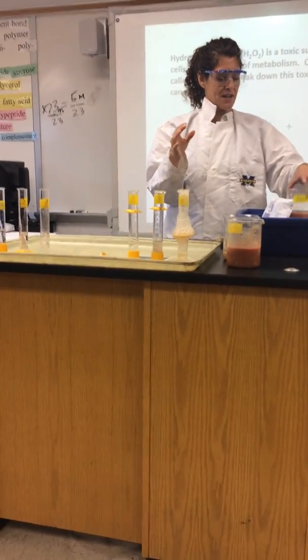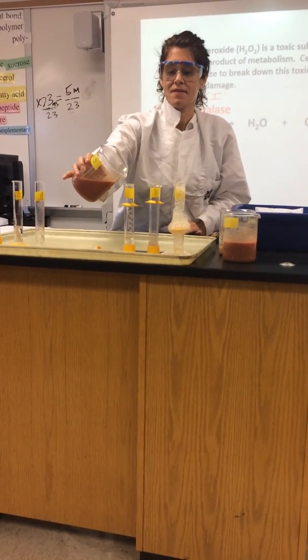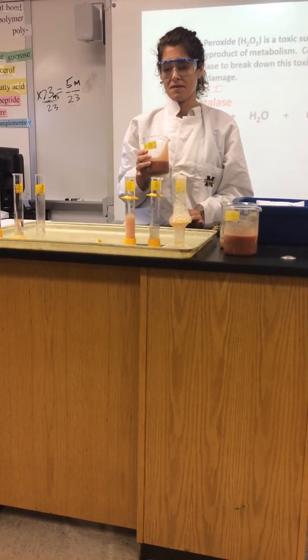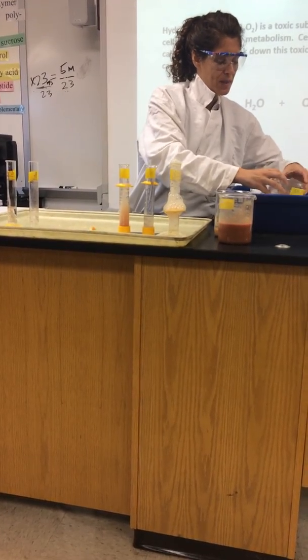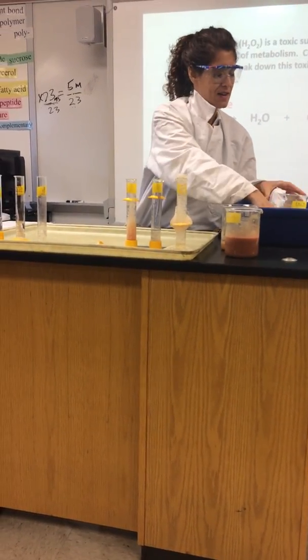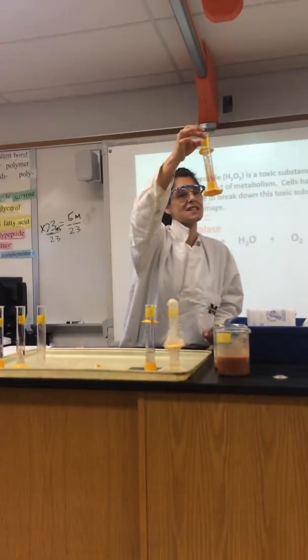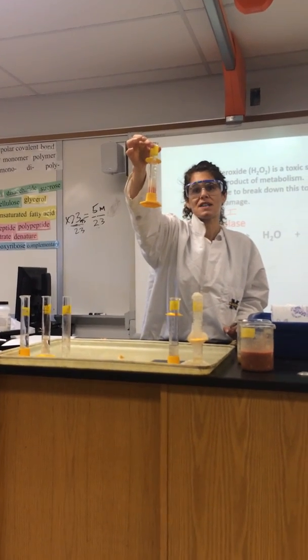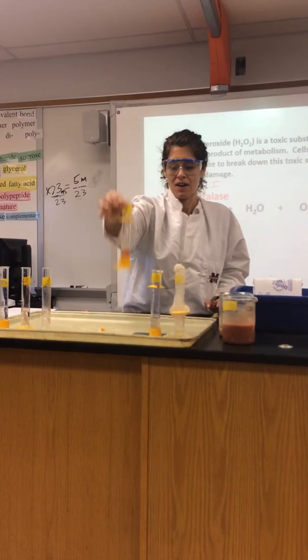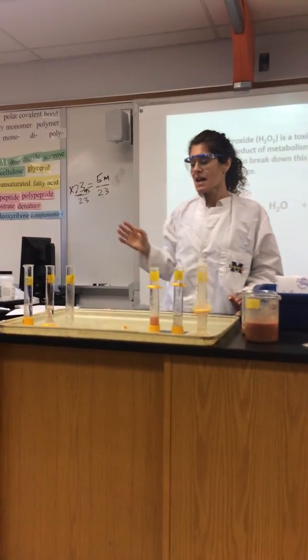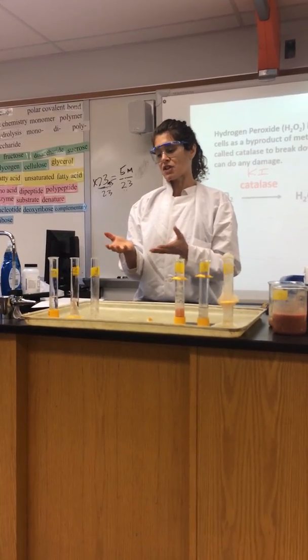Now I'm going to use the cold liver. I'm going to hold that up so those of you in the back can see what's going on. We have bubbling, but is that bubbling as vigorous as it was in graduated cylinder A? No, it was not.